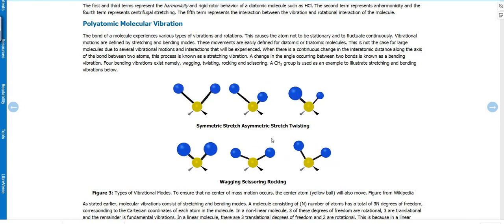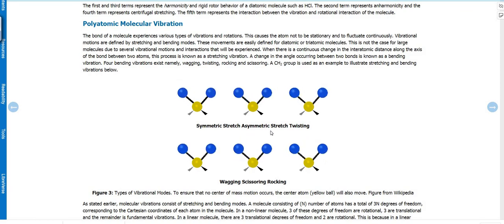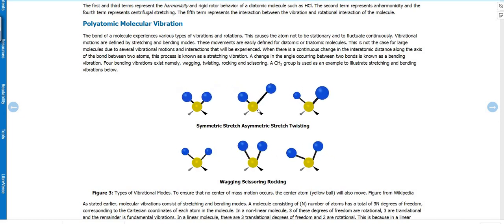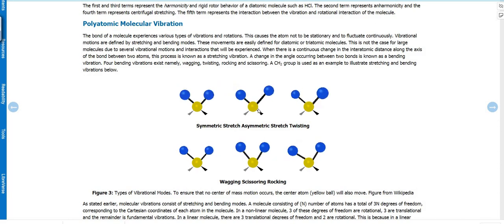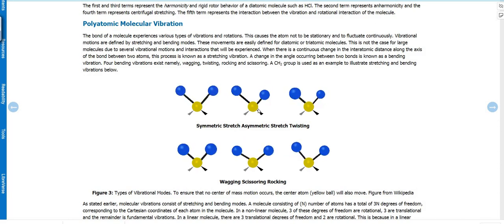The second one, it's possible for them to do the asymmetry stretching also. So it will try to stretch in the different direction. Jadi kalau you kata tangan you tu, satu bergerak ke atas, satu stay, satu bergerak ke atas, satu stay. So it will be asymmetric lah.